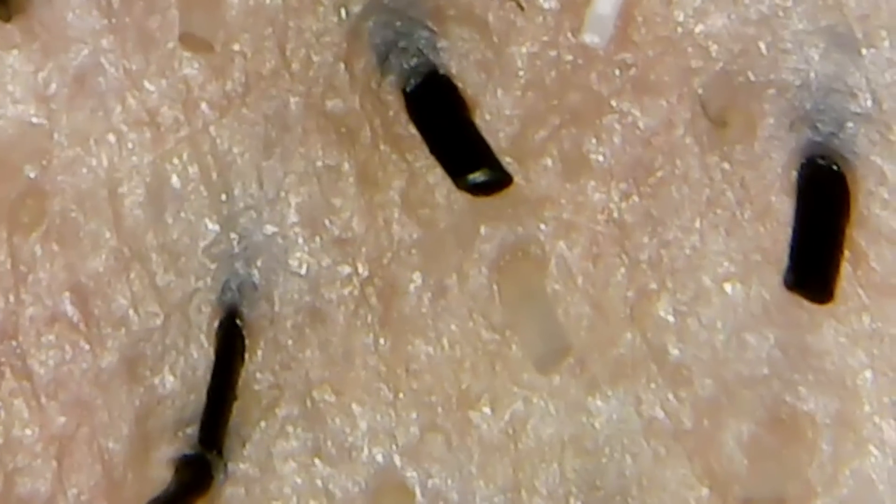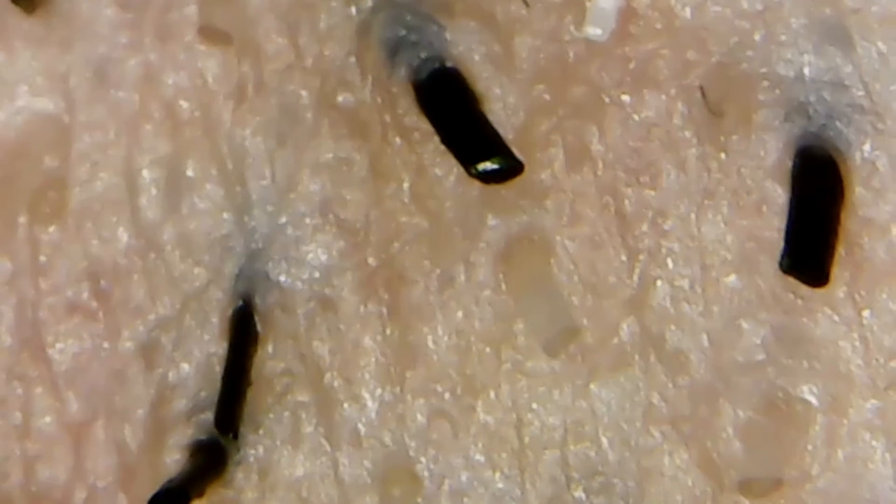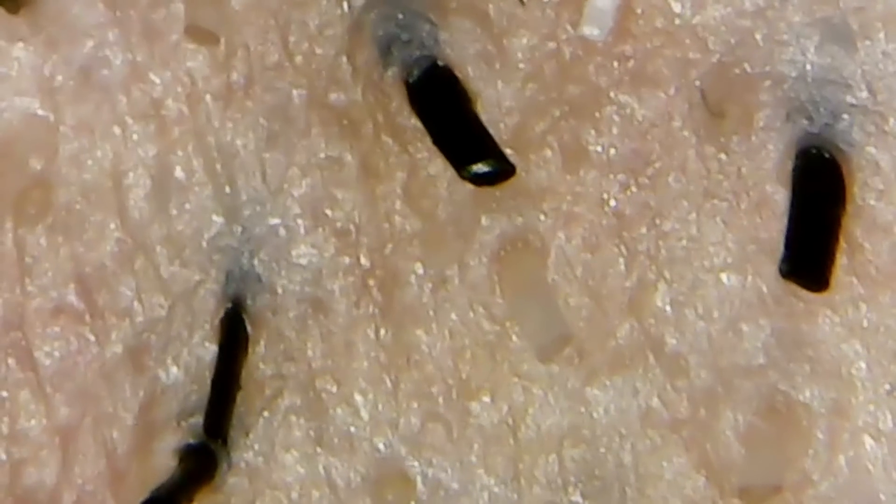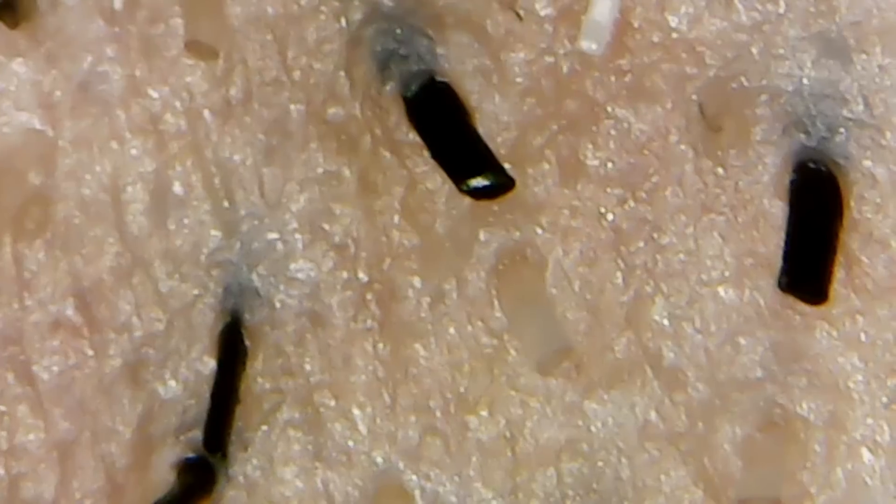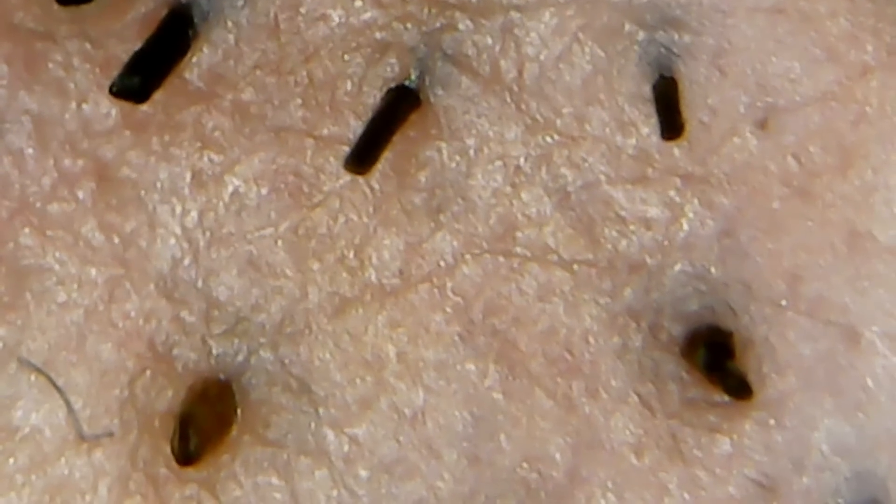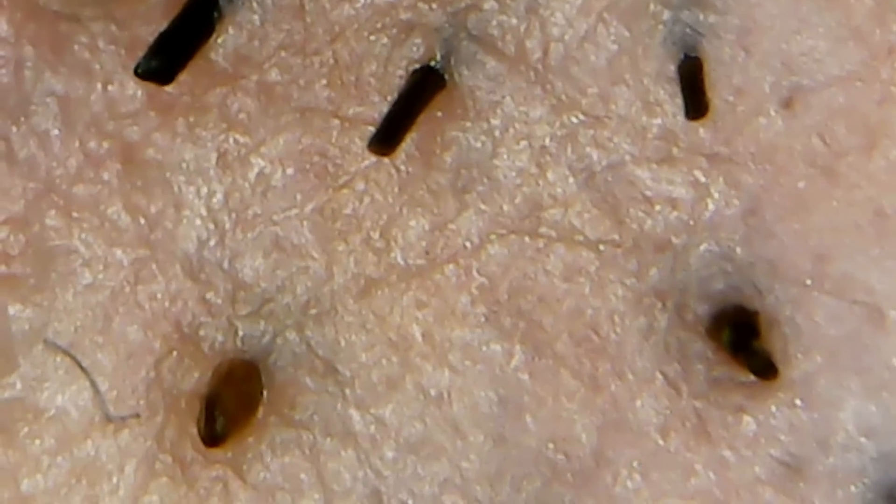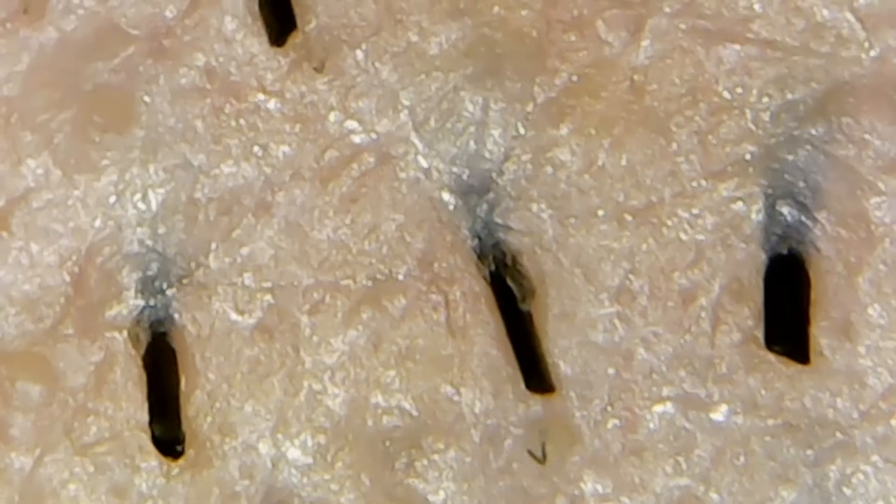I've pointed the microscope to my skin before I had a shave and this is what I saw. That's my chin here, and on the lower right you can see some of the beard looks white, which is because I'm already starting to get gray hair. I was pointing my microscope around all the different places on my face and could see all the impurities of the skin and the hair growing out.